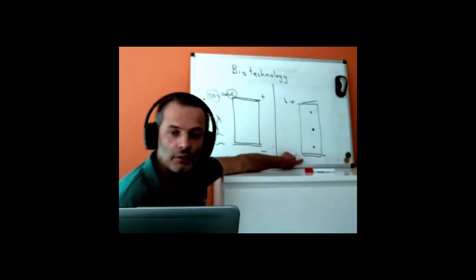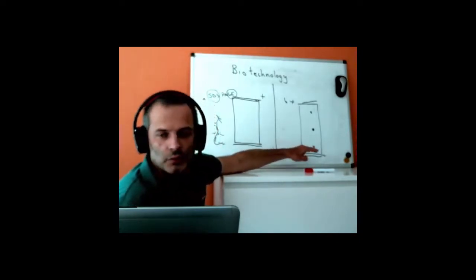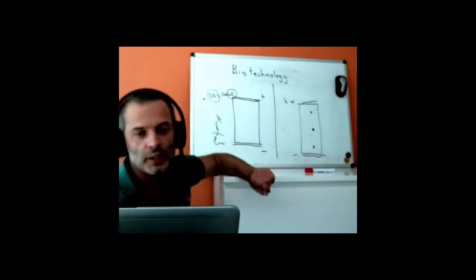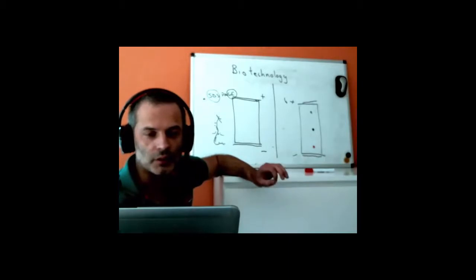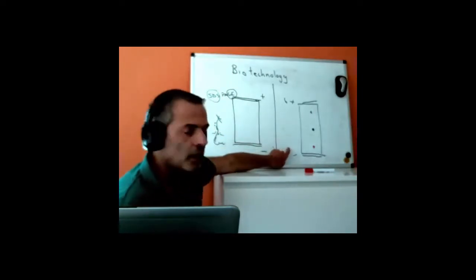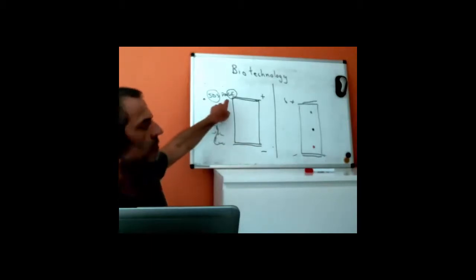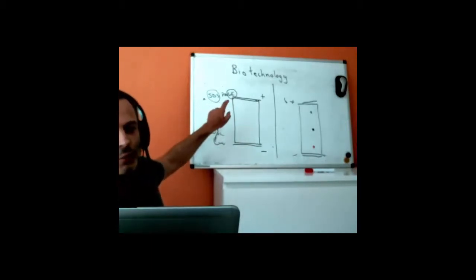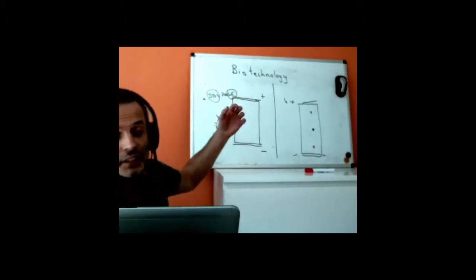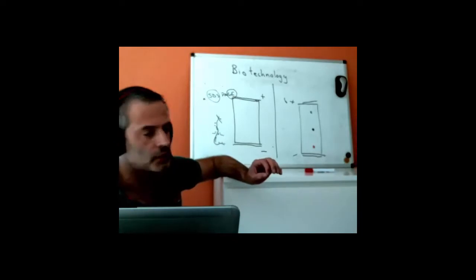If we leave this one on, nothing happens. The protein is stuck where it is. Of course, it can move sideways, so it will drift sideways, but it can't escape that point where it is, the height where it is at zero charge. This technique is called isoelectric focusing, and this technique is called SDS PAGE. I've ringed the two things that we know about. So the SDS is SDS, that's the surfactant, and GE stands for gel electrophoresis.